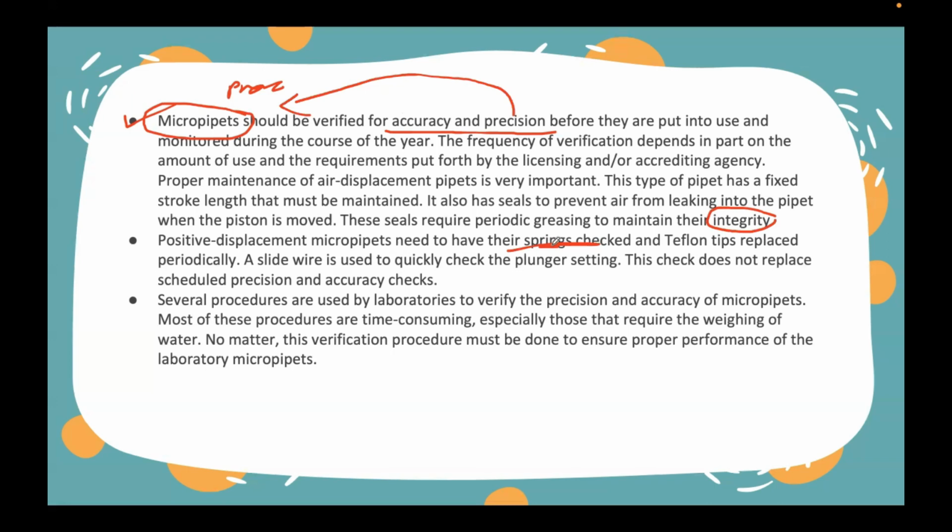So yung ating mga equipment sa lab, even yung mga micropipette natin, meron po yung preventive maintenance. Pwede po siyang every year or every 6 months. Kasama po yun sa pag-check noong ating license. So ang ating mga laboratory, meron po yung license to operate. So para po mag-grant tayo ng license, magko-comply tayo sa mga different requirements such as yung dapat sine-check po kung okay ba yung mga machine natin sa lab.